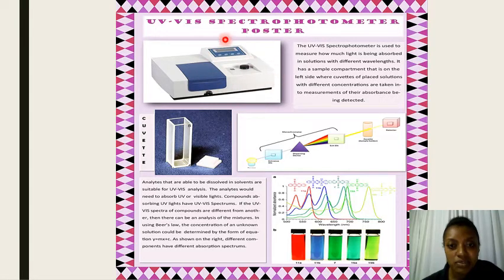Just at the bottom of the screen is the wavelength setting knob. This is to set a suitable wavelength for the solution that is going to be placed in this sample compartment. Just below the sample compartment is a black knob. This is the holder changing knob. When it is pulled, it moves according to the placement of the cuvettes being placed in here.